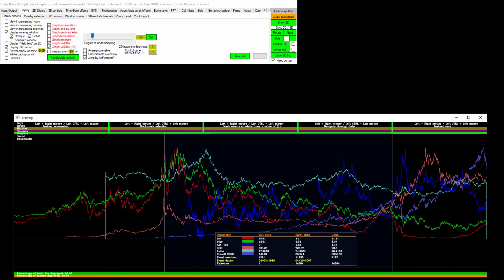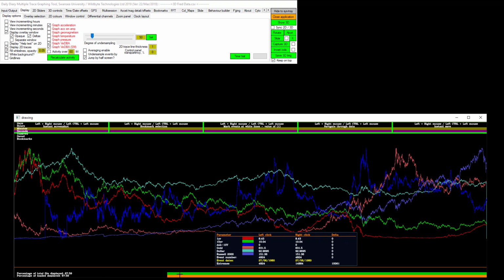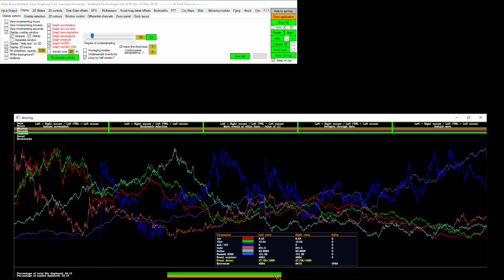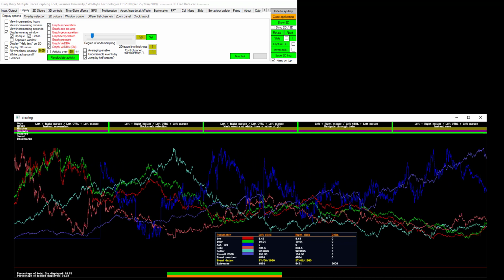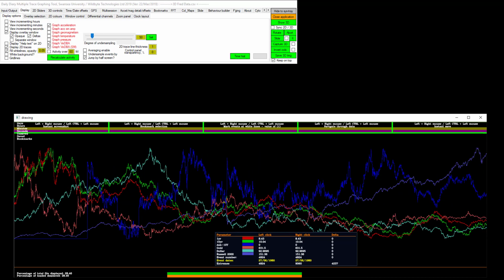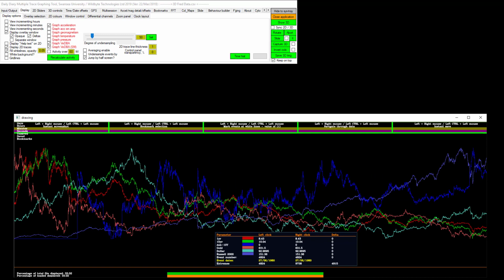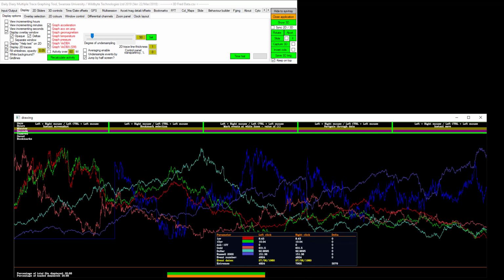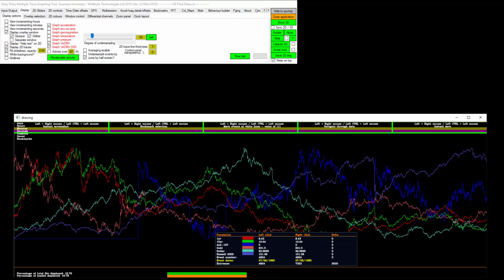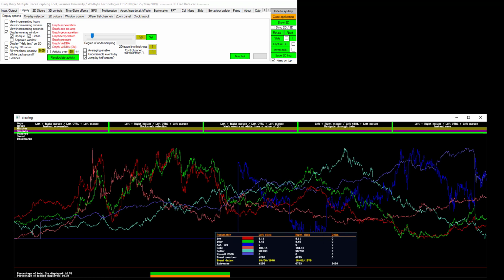That's when you click above this orange line. When you click below the orange line, you're adjusting the start time point of what you're viewing, and the right click is the right time extreme. Notice the graphs above here will automatically rescale based on the max and minimum data in view, so they don't go off the top. If you hold down the left Alt key, you can keep this window width and slide through the data.